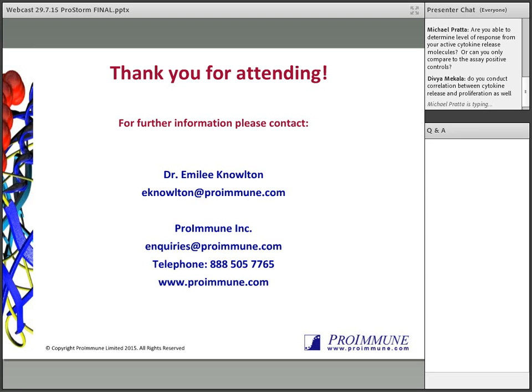I don't think that one platform is really going to be able to address all of the different biotherapeutics that are out there, and it's best that you use the assay that's most relevant to your drug. We haven't done any direct comparisons between our soluble version versus immobilized, so that would certainly be an interesting study. And these are really great questions. I thank you, everyone, for participating.